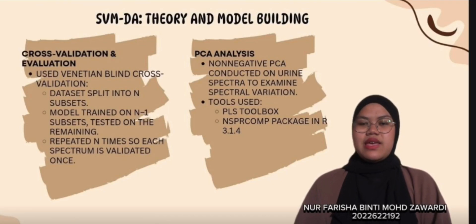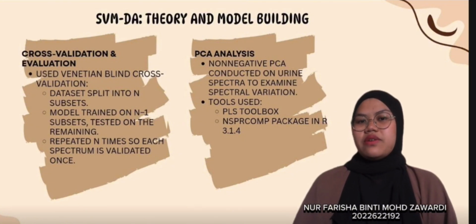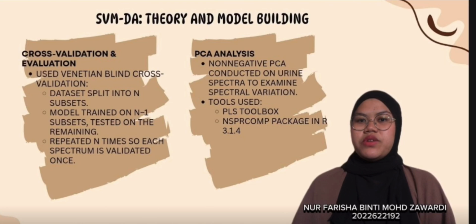Next is PCA analysis. Non-negative PCA is conducted on urine spectra to examine spectral variation. One of the tools used is the PLS Toolbox.